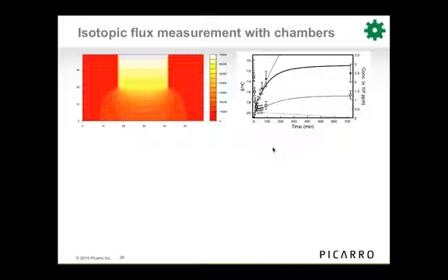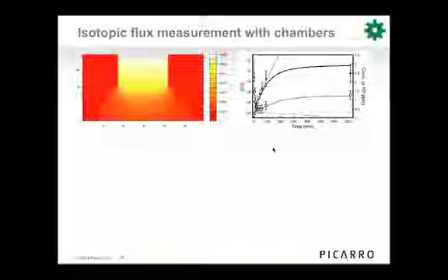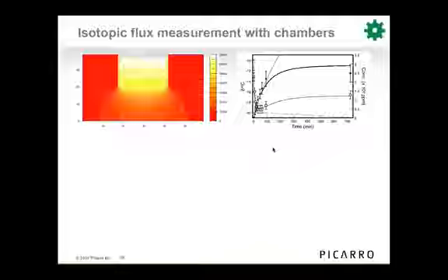So you see the dotted gray line there. That should be what we would expect the trajectory to be. What we actually find is that the trajectory reaches a minimum and then springs back because of this differential diffusion of the isotopes. That can cause a bias in chamber measurements of between about 0 per mil and 10 per mil. So it's pretty substantial if you're looking at natural abundance studies.